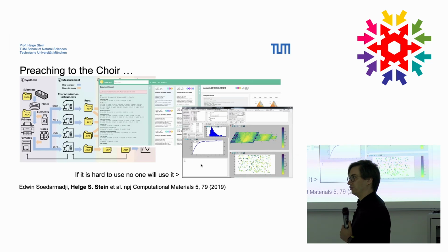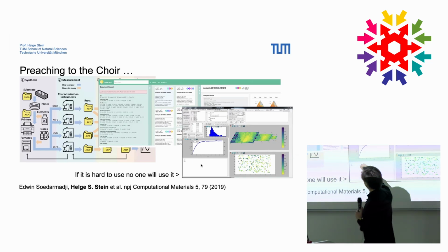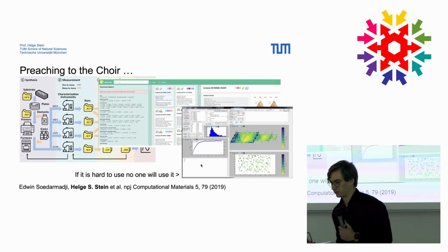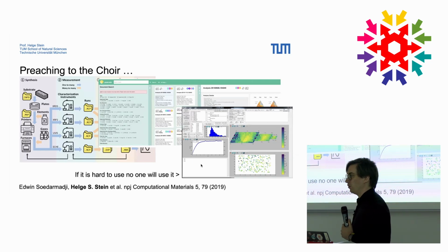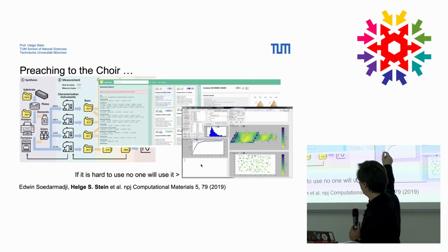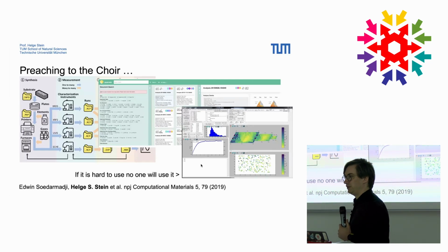But what we knew was that for most of the analyses, if you just analyze a CP electrochemical experiment, the way you analyze it doesn't really ever change. So why not have a standard function that you can maybe tweak a little bit, but this way we know everybody using our software internally, we know exactly how the data points came about, and we even made it simple for people.